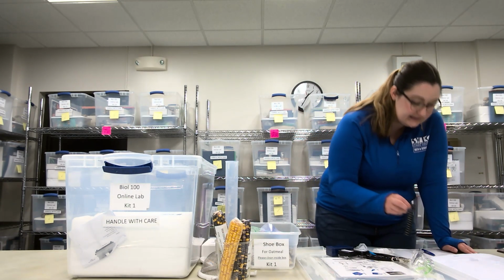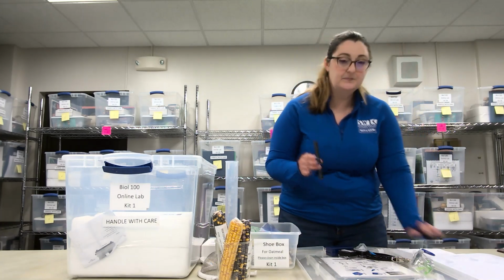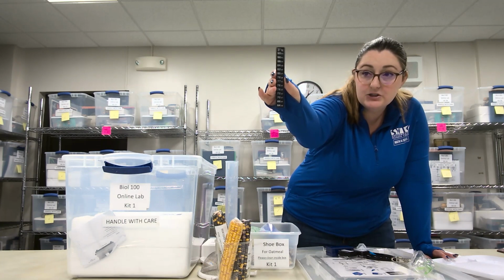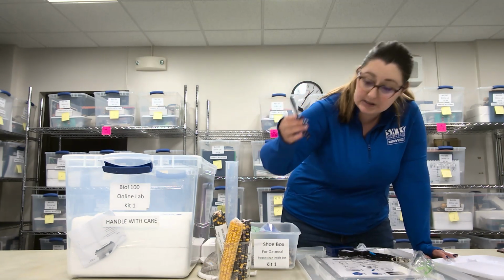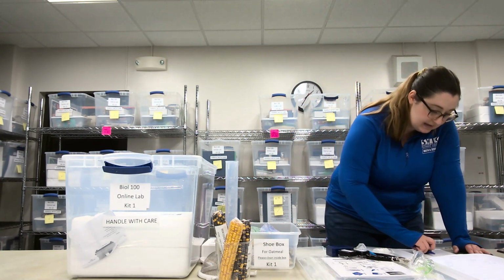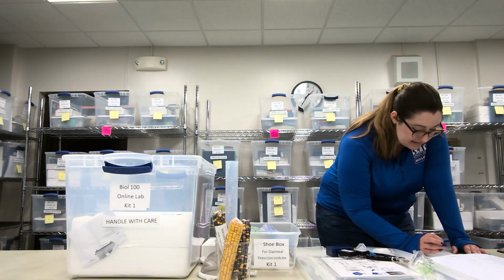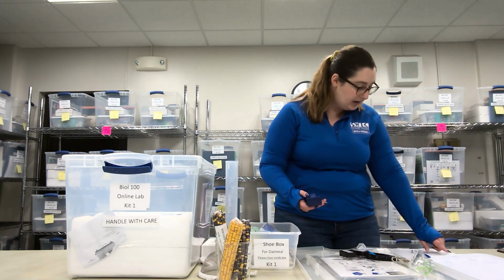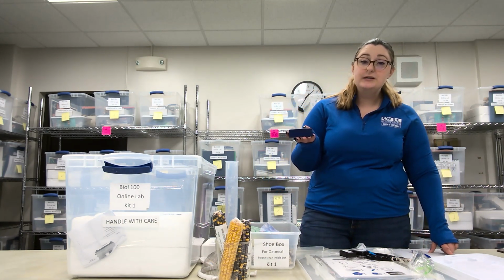Next is the thermometer sticker. So it's going to look like this. All right, make sure that you have a thermometer sticker. Go ahead, put that into the shoebox. Check it off of the list. Good to go. From there, you are going to find the blue slide box.